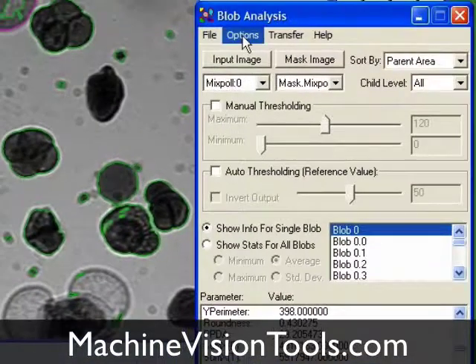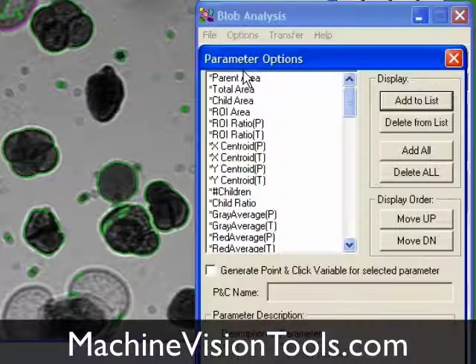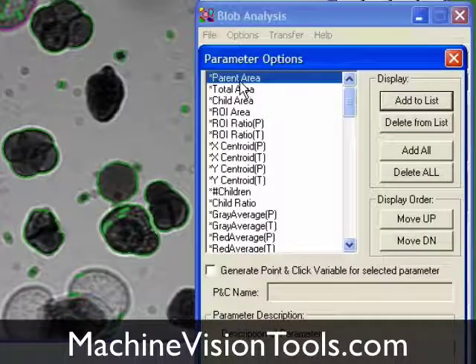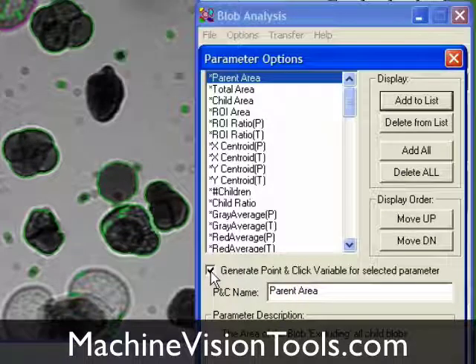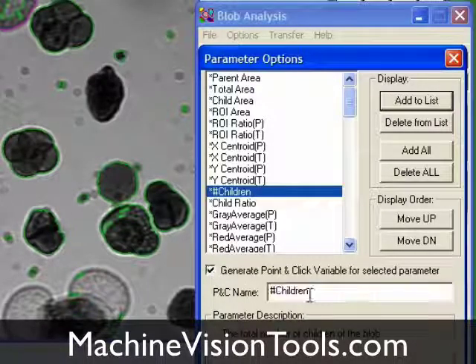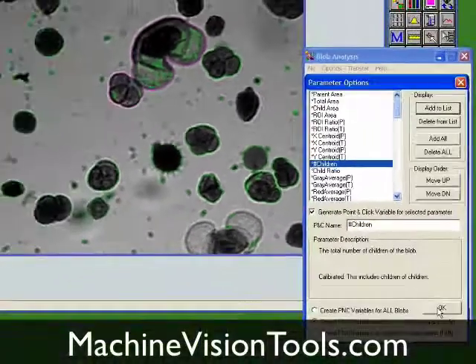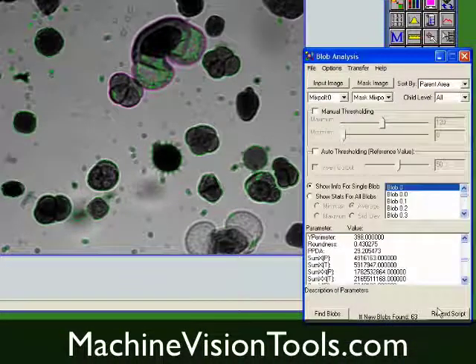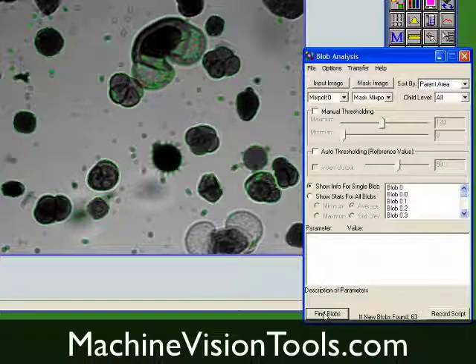If we want to use any of these numbers we've calculated in point-and-click scripts, we go to the Parameter Options dialog, select the statistic you wish to use, click Generate Point-and-Click Script Variable for a selected parameter, edit the variable name if desired, and continue on for any other statistics you wish to create point-and-click script variables for. With those options set, we click Find Blobs again, and the point-and-click script variables will be created.